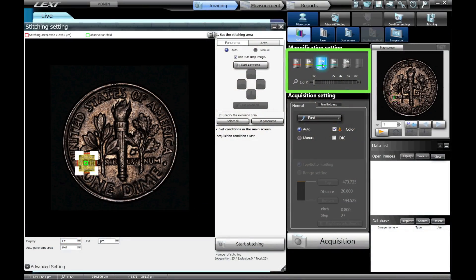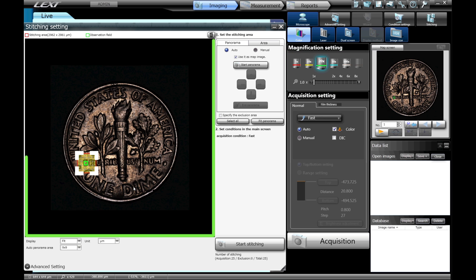Setup is simple, too. Select the intended magnification and necessary area, then a stitched image is acquired automatically.